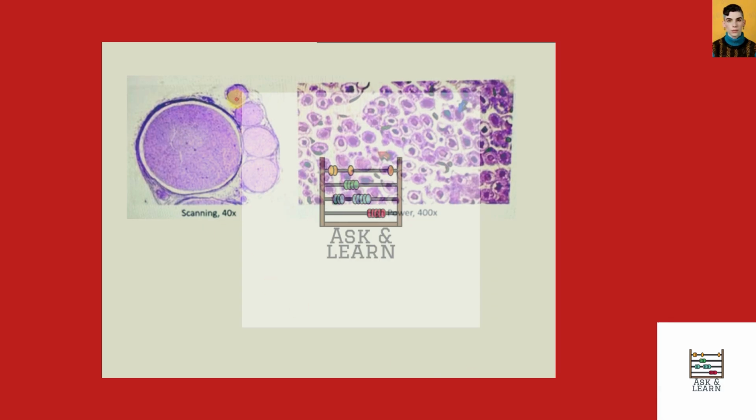These round structures, whether they are big or small, they all represent the nerve fascicles.